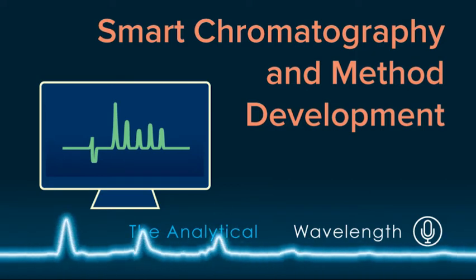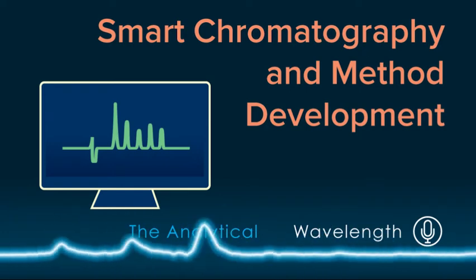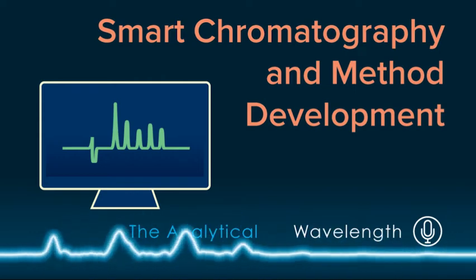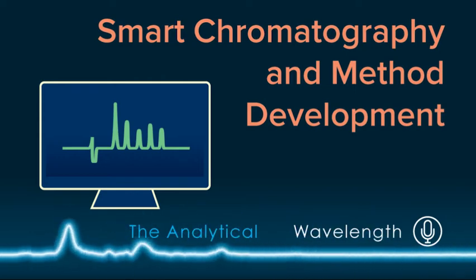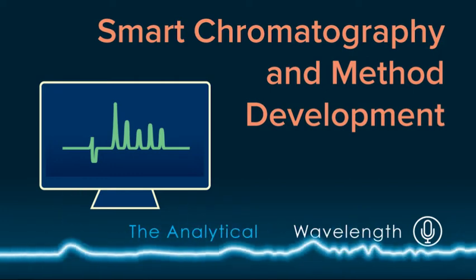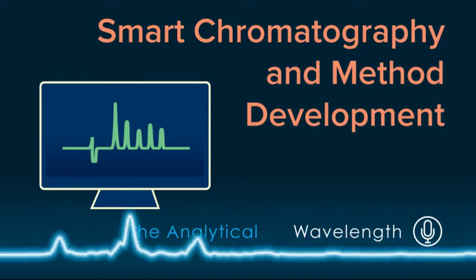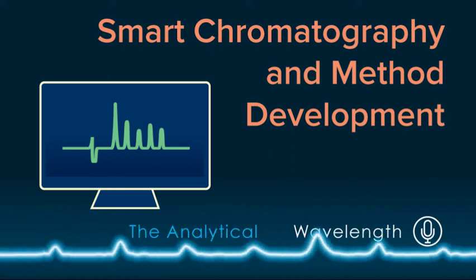And also worked in a system where here at GSK in particular, we actually have a suite of columns that we leverage, and then we have prescribed gradients. And sometimes people use in silico software, sometimes they don't, depending on what comes out of those gradients. And all of those are actually useful and can be time consuming. And as you mentioned, the use of the in silico software can expedite that process of coming up with those more efficient conditions, and really have enjoyed that opportunity to, whether you're doing a full control or not, basically interpolate around some boundaries.